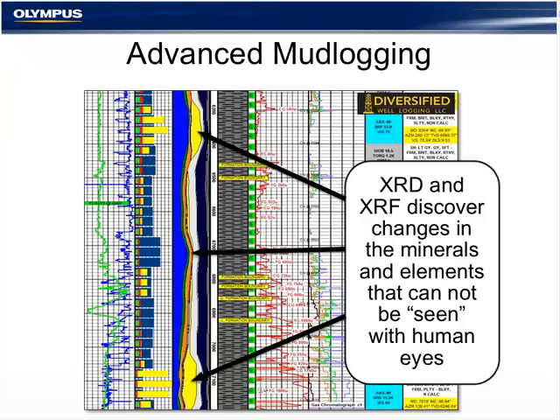With clarity, you can see areas of the well that have more carbonates, are more silicious, and places of changes in the clay. Now, on more of the spreadsheet level, the trace and the marker minerals have a myriad of applications in exploration and reservoir characterization.